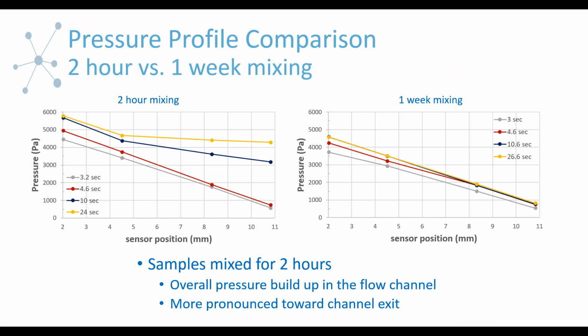So if we want to just compare, side by side, some of the details of the system. Here we're just going to look at the pressure profiles for the 2 hours versus the 1 week of mixing. And so this is again just pressure versus sensor position. On the left we have the sample that was only mixed for 2 hours, and on the right we have the one that we mixed for an entire week.